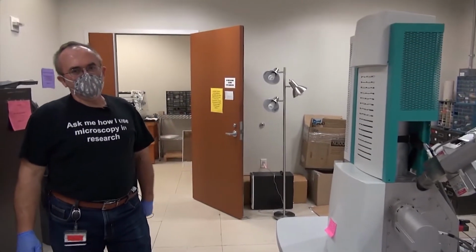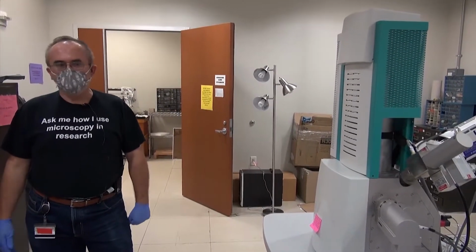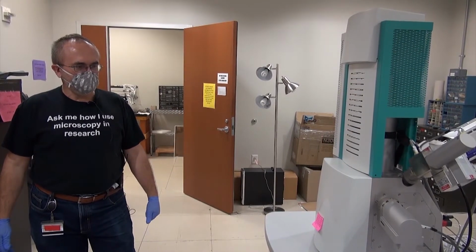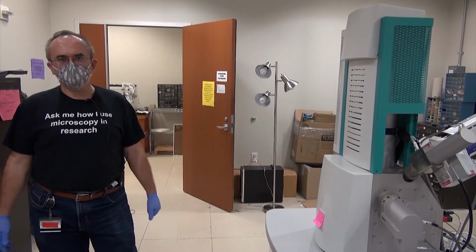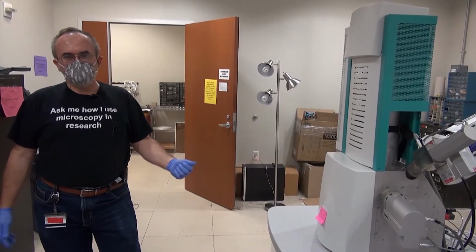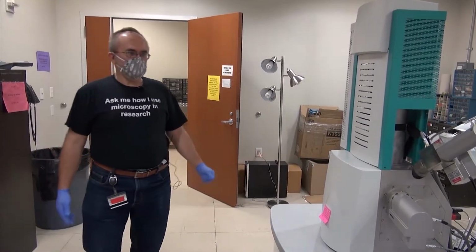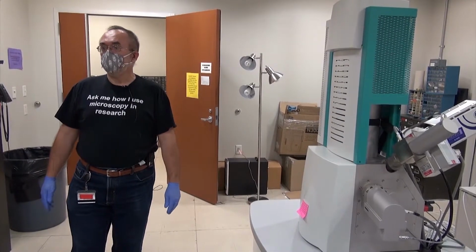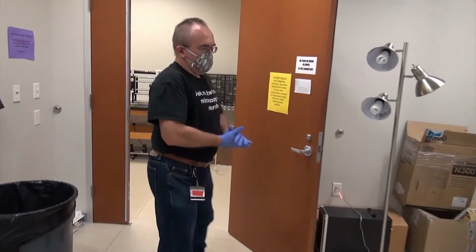This instrument has a computerized stage, fully motorized, and we also have the Alicona MeX software for 3D reconstruction of surfaces from stereo images and for analysis, for instance, roughness or texture analysis. The resolution is down to about 3 nanometers under ideal conditions. And now let's go look at our other SEM.